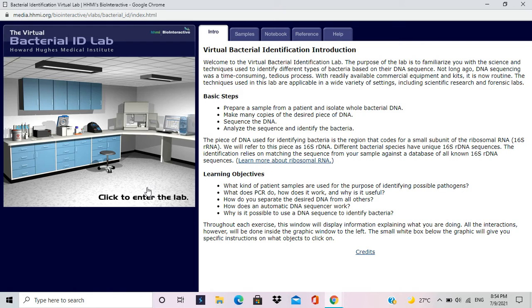linked by morphological and biochemical tests, supplemented as needed by specialist tests such as serotyping and antibiotic inhibition pattern. Newer molecular techniques permit species to be identified by their genetic sequence, sometimes directly from the specimen.